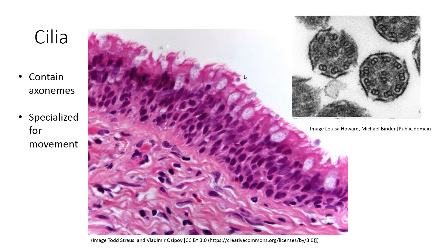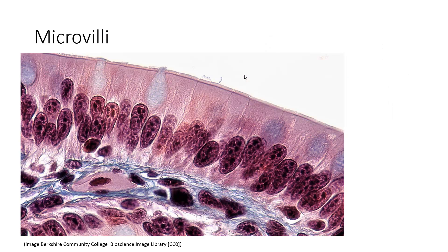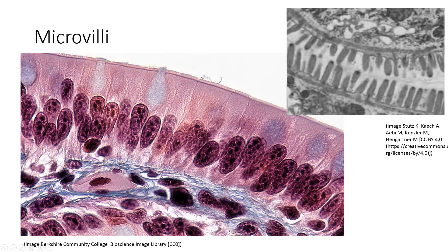Let's compare that to the other apical surface modification: microvilli. Microvilli are these thin, thin, thin structures. We can see hundreds and thousands of them here on the surface of this epithelium, which also has goblet cells in it. If we look at microvilli in longitudinal section, we know that there are no axonemes in here.